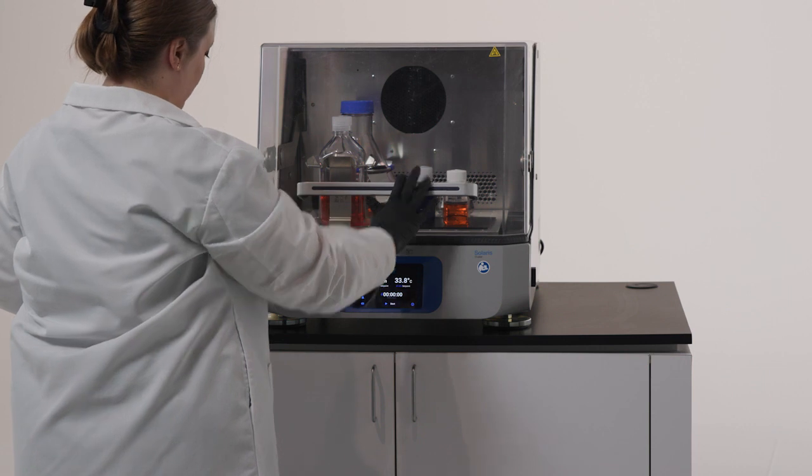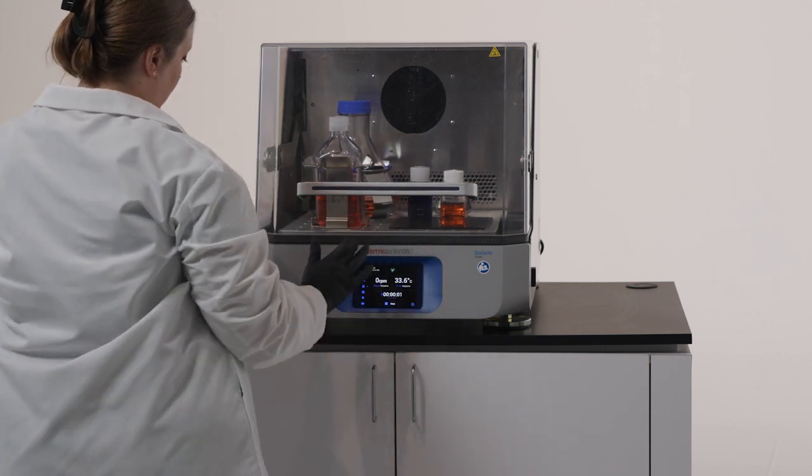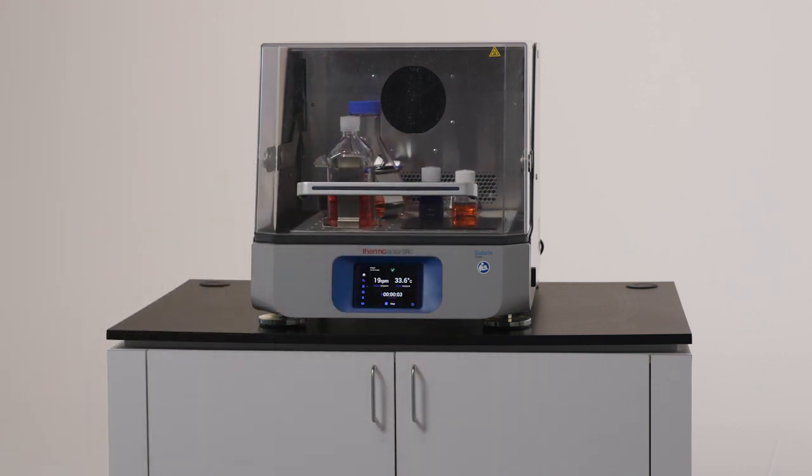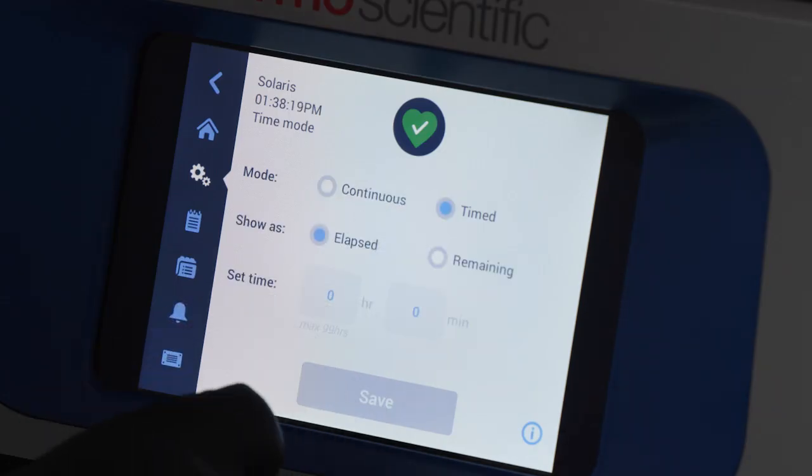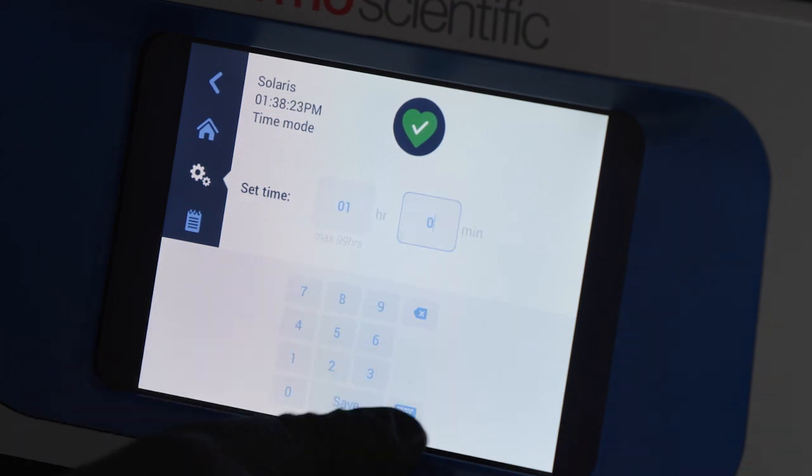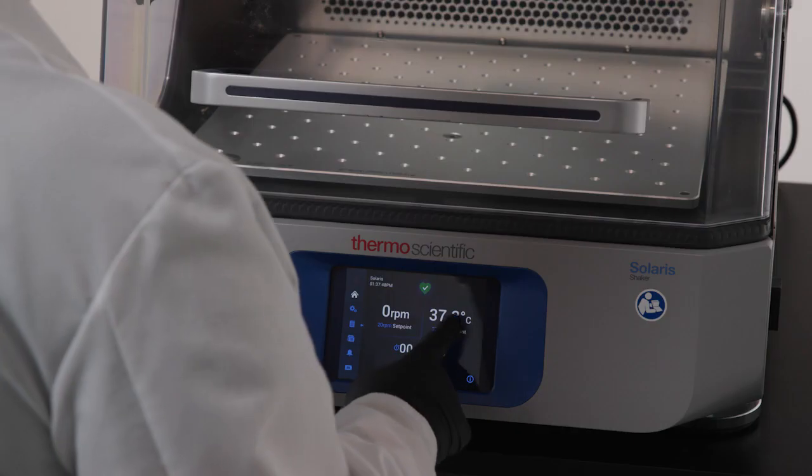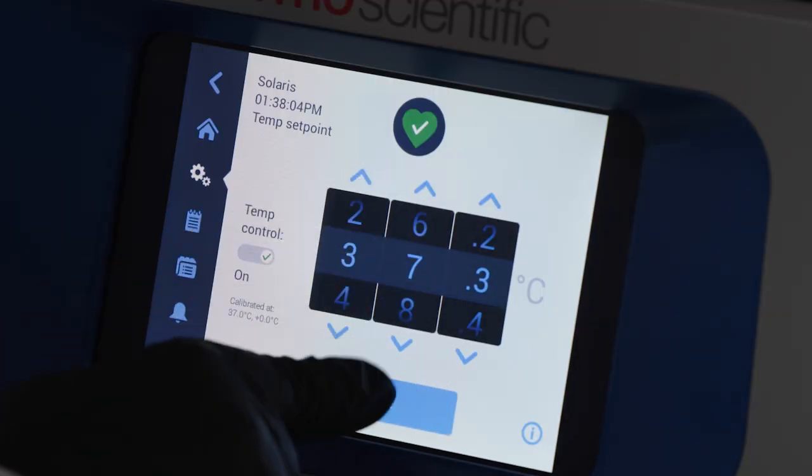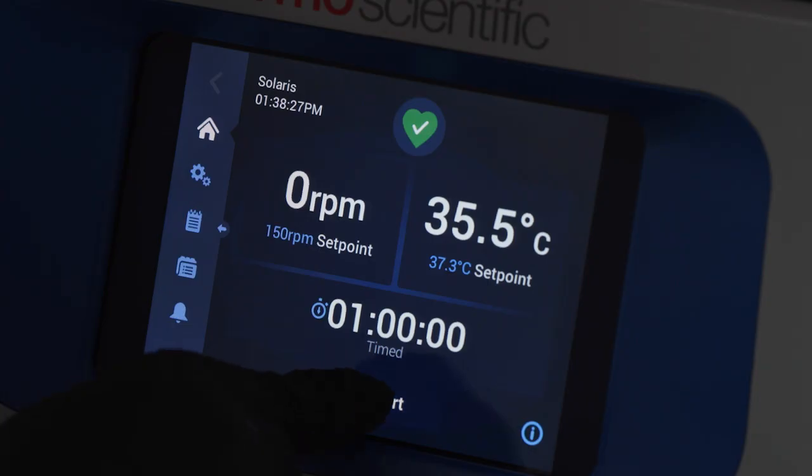Starting your shaker is simple and can be done by running a saved program or a new one, or by simply setting up a timed run. To set up a timed run, select your desired run time, temperature and orbit speed on the display, and press run.